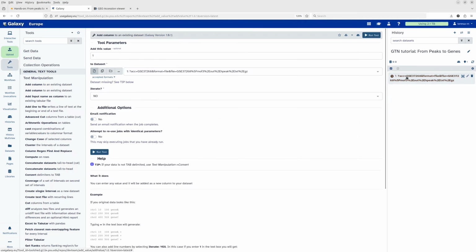You see at the moment this job is gray because it did not start uploading. Once it starts uploading, like now, the job will turn orange or yellow. And once it's uploaded, this box will turn green. And then we can also have a look into the file. So I will pause for a little bit until the upload is finished.